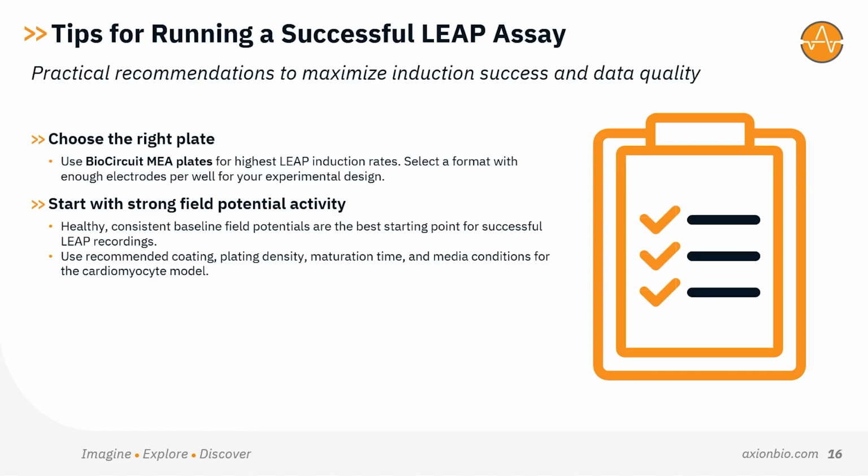This means that the fundamentals of MEA recording still matter, using the recommended coating, plating density, maturation time, and media conditions for the cardiomyocyte model. Good LEAP data starts with good cell health and good baseline MEA activity.